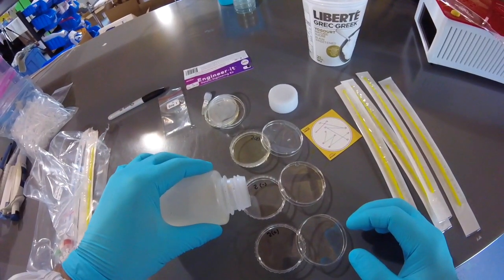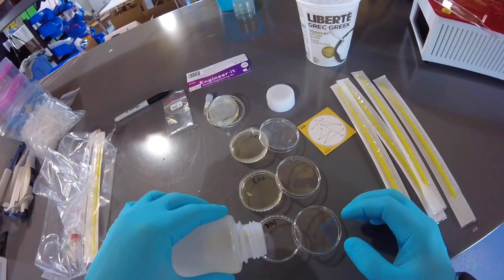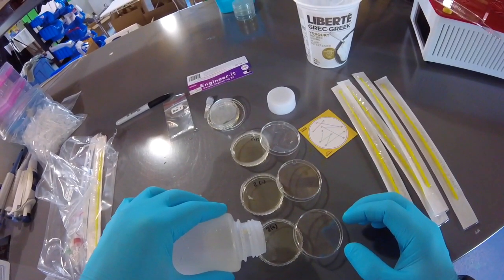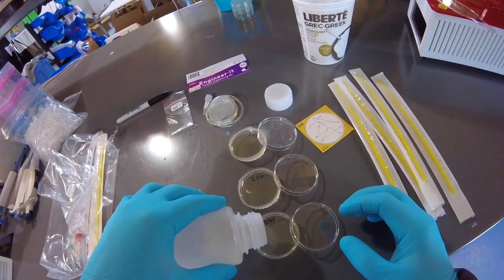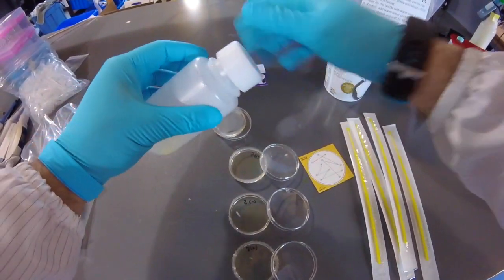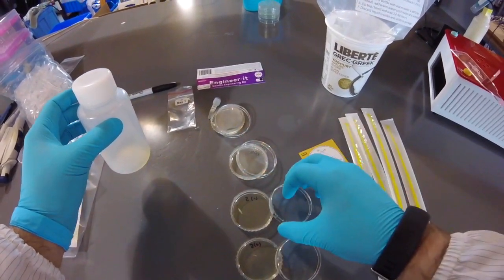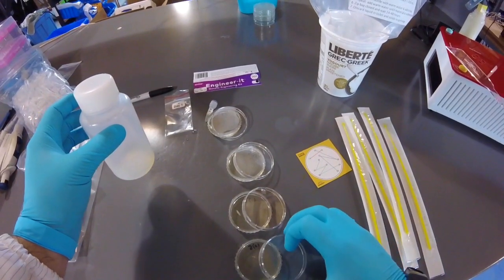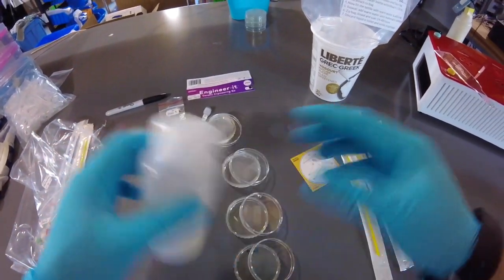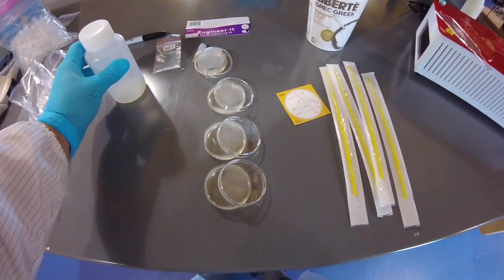Okay. That gelatin will dissolve through time, okay? Alrighty, there we go. So I'm going to put these back on most of the way and let these sit for about 15 minutes and they will solidify and we can move on to the next step.